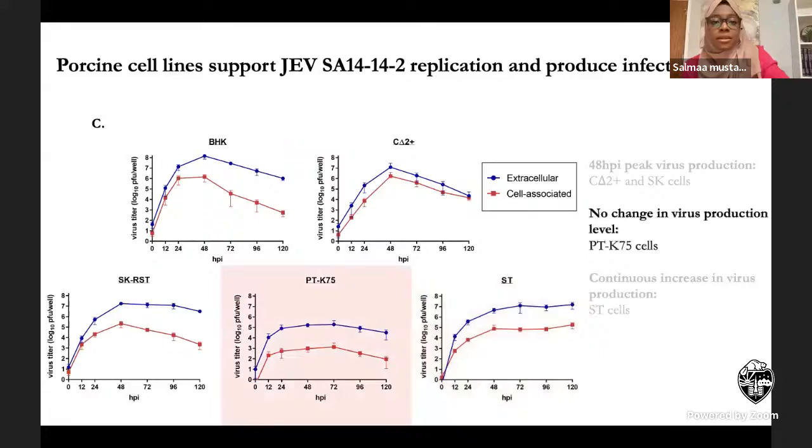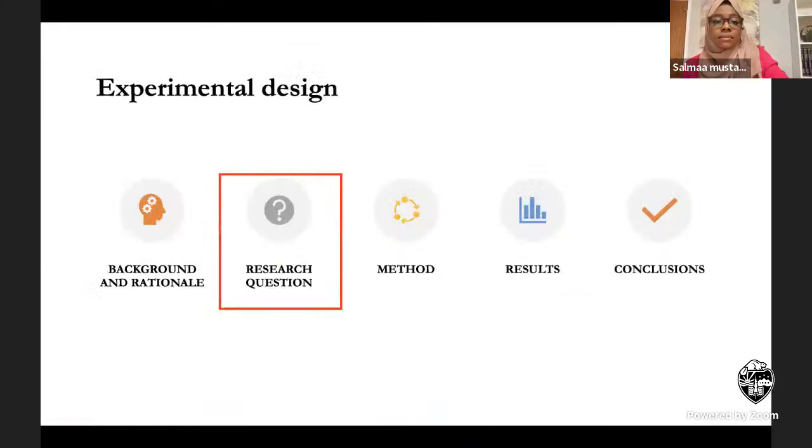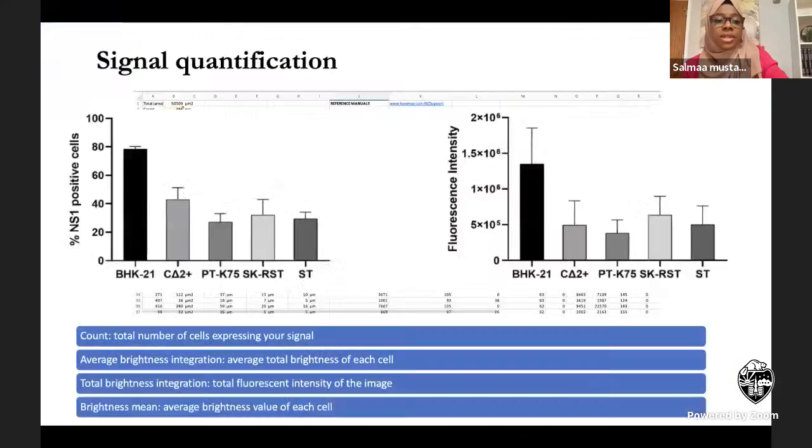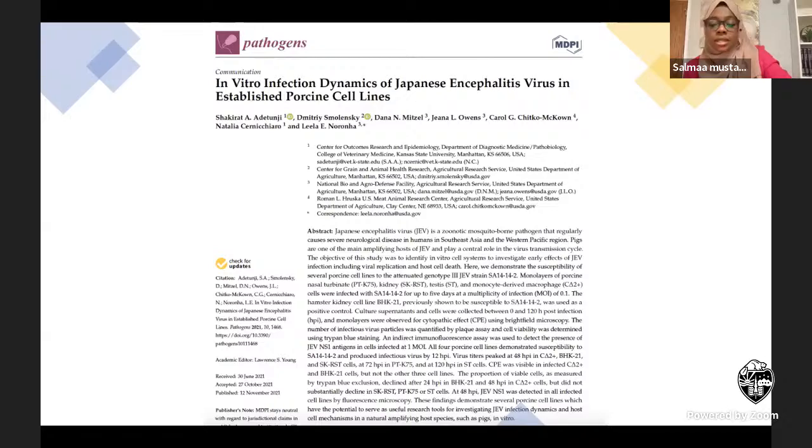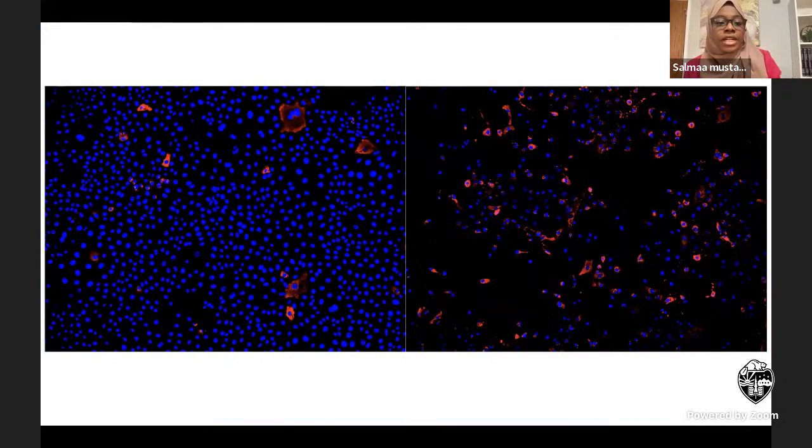So all of these numbers, there's a way that you can adjust them in the system to help you determine that the signals you're looking at are mainly your proteins and not the cell's autofluorescence. For example, here, it's really clear, the one on this side, that I'm looking for red signals and they're inside the cell.